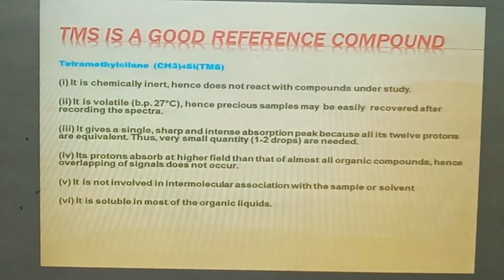And finally, it is soluble in most organic solvents. So we can use all sorts of deuterated solvents like CDCl3, deuterated DMSO, deuterated benzene. All sorts of these organic liquids are soluble with TMS. That's the importance of tetramethylsilane used as a zero or reference standard in NMR spectroscopy.